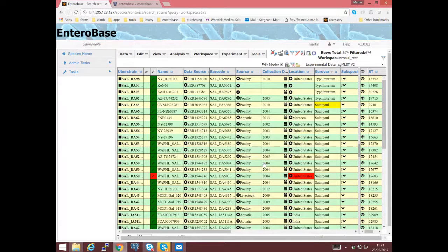So this will take a few seconds because it's querying the database, and then it should come back with any changes. Again, it worked last night. Okay, try it again.